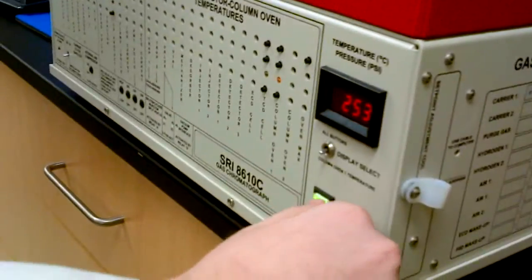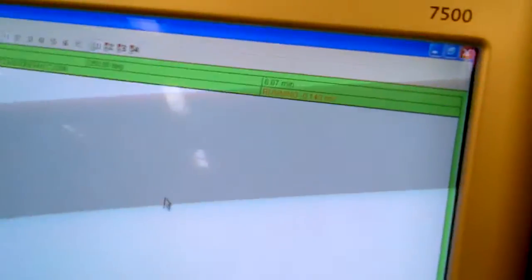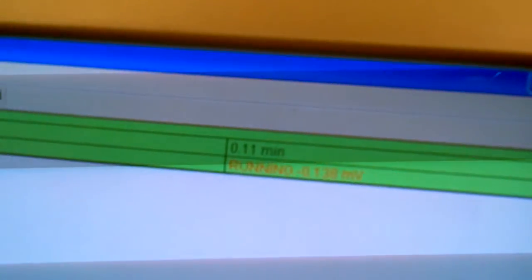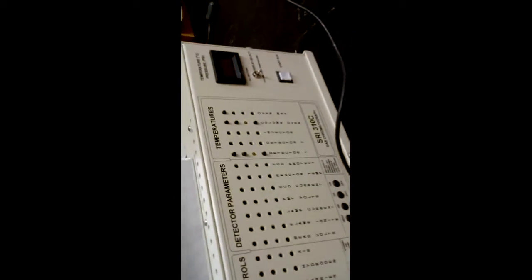There we go. And over here on the computer screen we can pretend that something's happening. As you can see, the time is running and there's a little line down there at the bottom of the screen. And this is where we sit and stare. So a gas chromatograph is a box with a pressure control and a temperature control and an inlet for injecting the sample. And there's a coil that's got some white stuff in it, works just like thin layer chromatography. And there's a detector and we get a signal out of that. Isn't that cool?